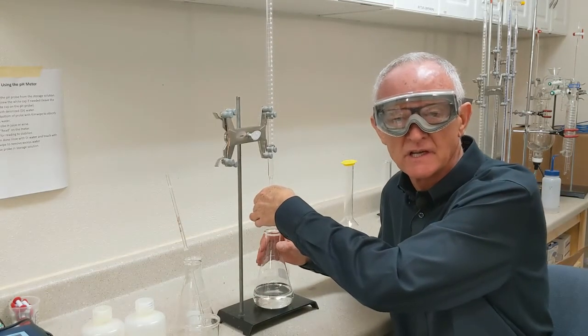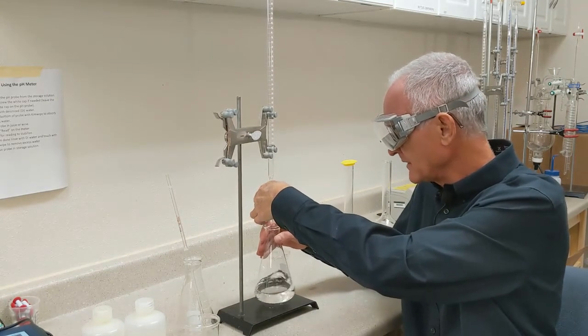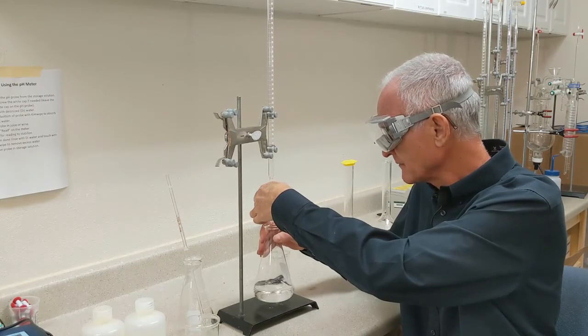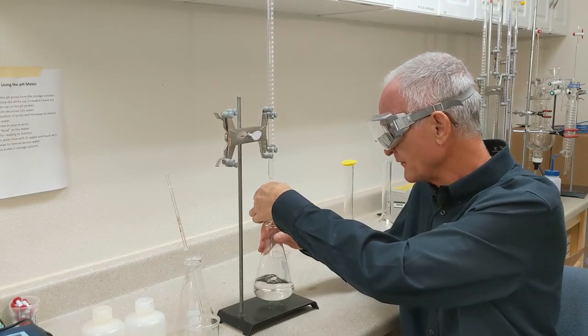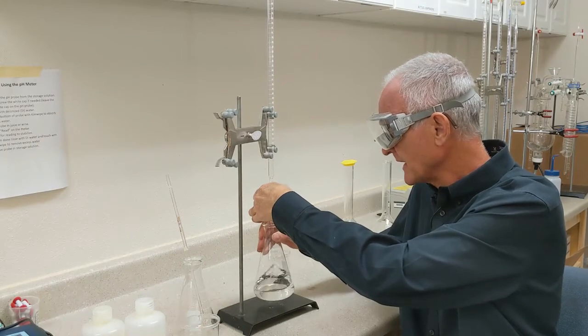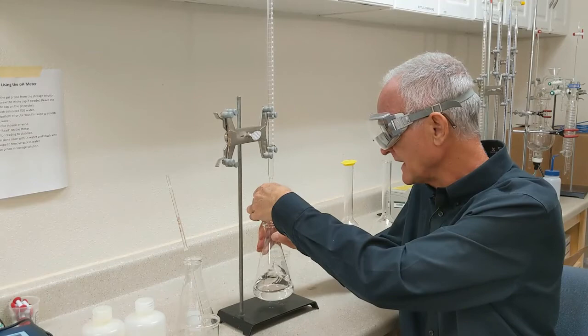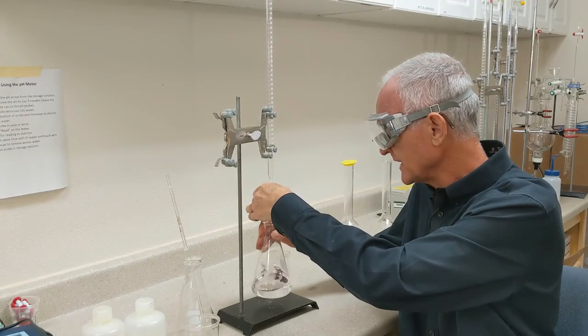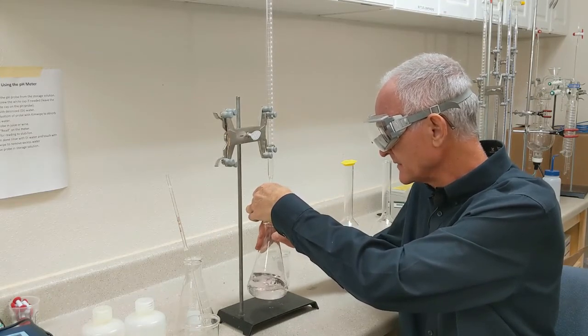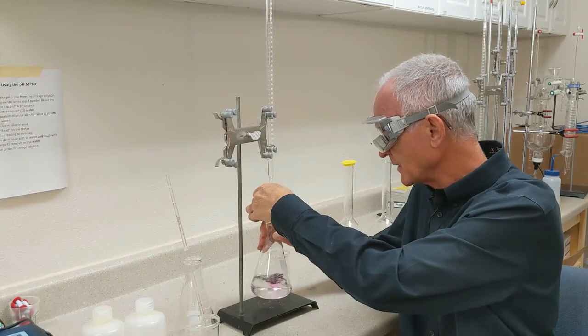I'm redoing this. I did a new 200 mils of water. Put phenolphthalein in that. I neutralized the water. And then I added five mils of wine. And now I'm titrating once again to try to get to that nice pale pink endpoint.